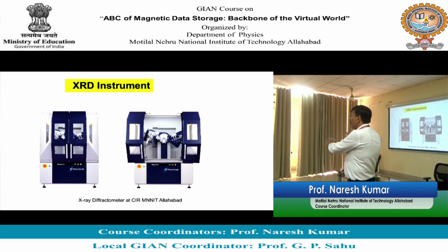ह्यूमन बींग और एनवायरमेंट के लिए हम क्या है कि यार एसिड लिया, काम कर दिया, उठा के नाली में फेंक दिया. We usually do that, but no, in the Western world it is not the case. There is a proper disposing mechanism. Unless you follow that protocol, no, you will be banned. जहाँ जरूरत है ग्लव्स पहनिए.